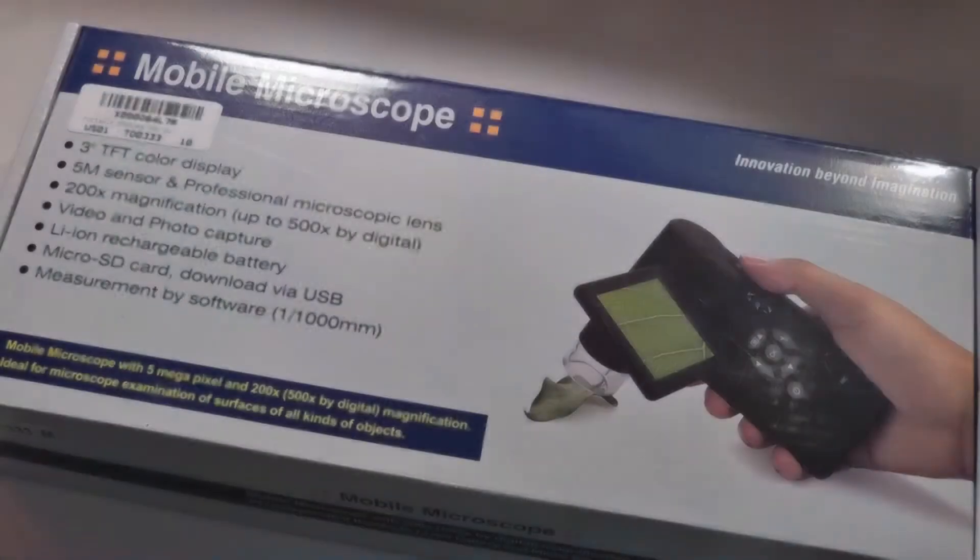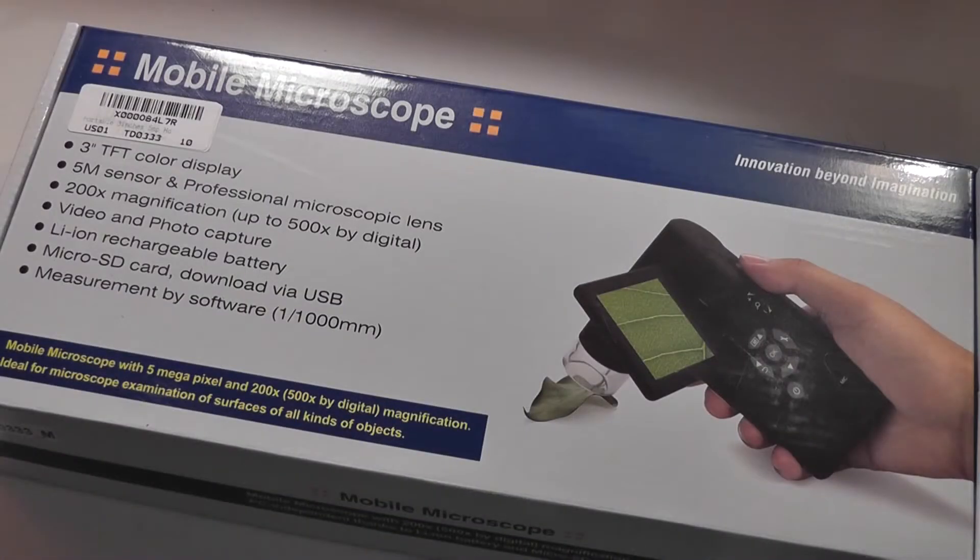Hey, Deluxe here at OS Reviews. You're watching our video review of the mobile microscope. As with anything in the 21st century, we're starting to see a digital revolution with more and more digital devices from smartphones to tablets, and now even in products that are typically non-digital like microscopes.